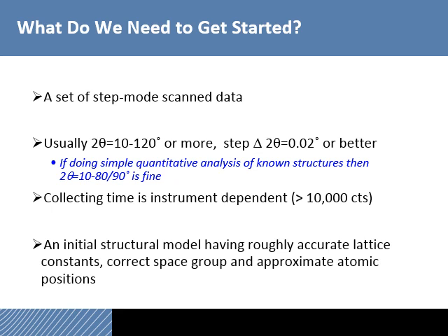As we've discussed previously, the counting time is instrument dependent. You want sufficient counting time that you have at least 10,000 counts in your strongest peaks.